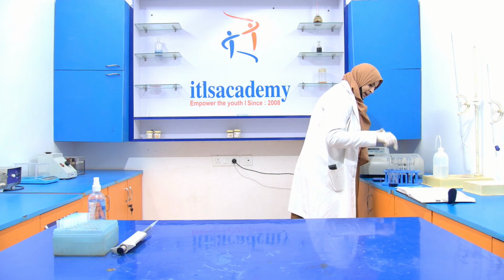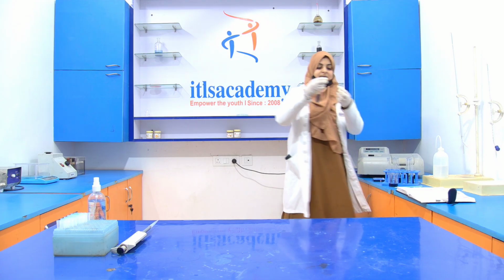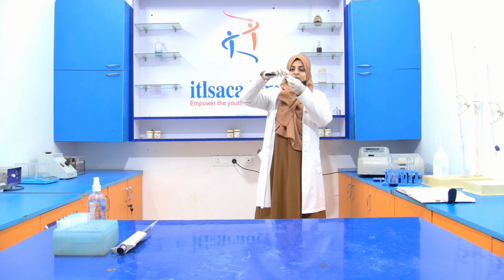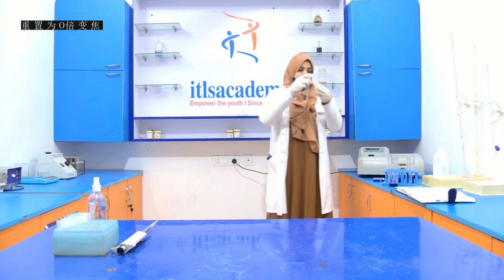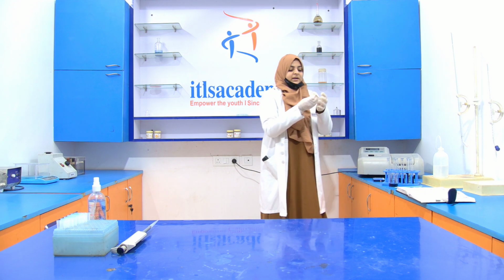Then take 0.8 ml. Transfer it into the cuvette. Now dry it with the help of the filter paper.